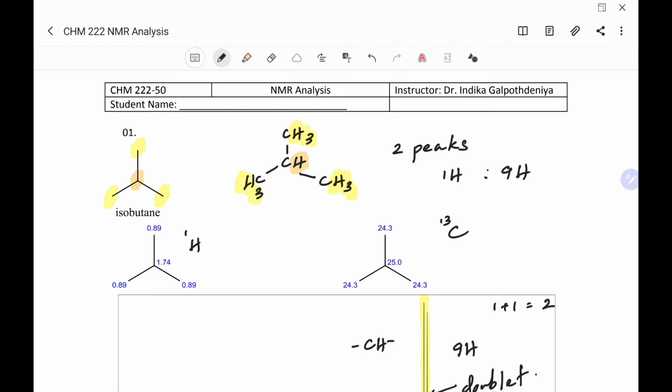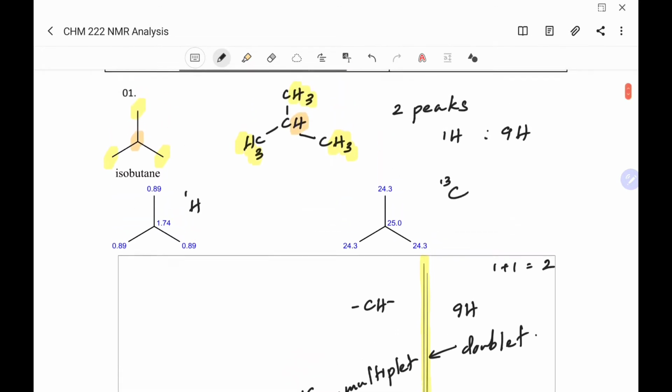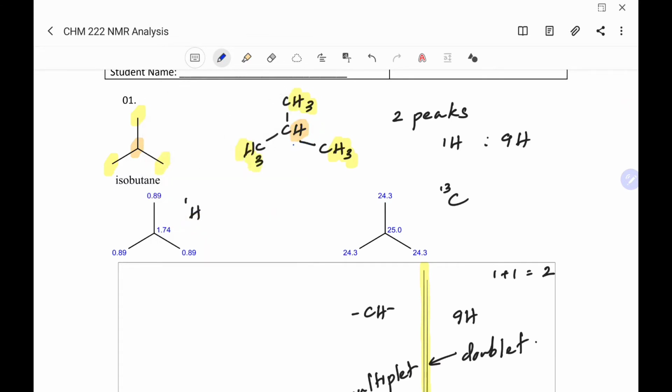So you have 2 chemically different hydrogens, the one in orange and the one in yellow. And here's the thing, they are all basically alkane hydrogens. There are no interesting functional groups next to them, so you can expect the peaks to be around 1 ppm. So all the peaks should be around 1 ppm. Let's write that down. This hydrogen should also be around 1 ppm. This hydrogen should also be around 1 ppm.